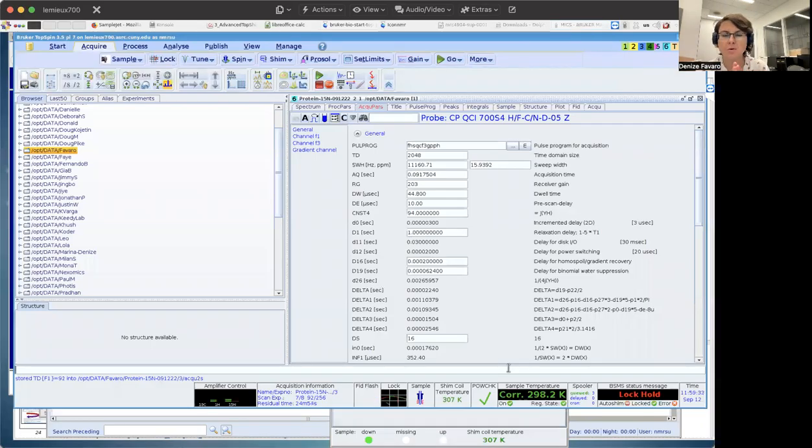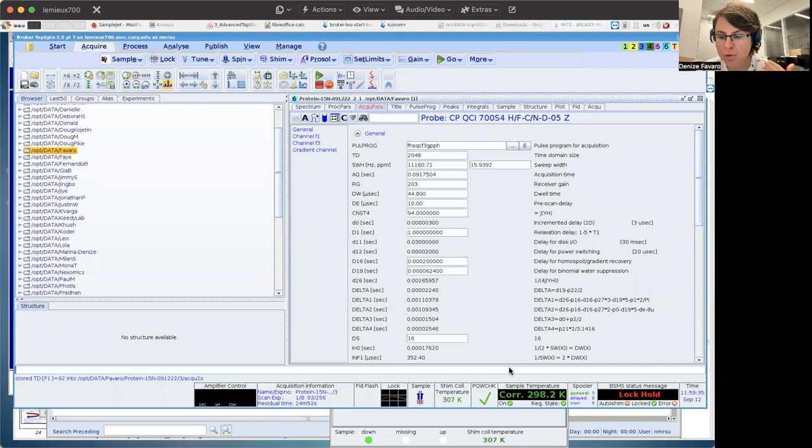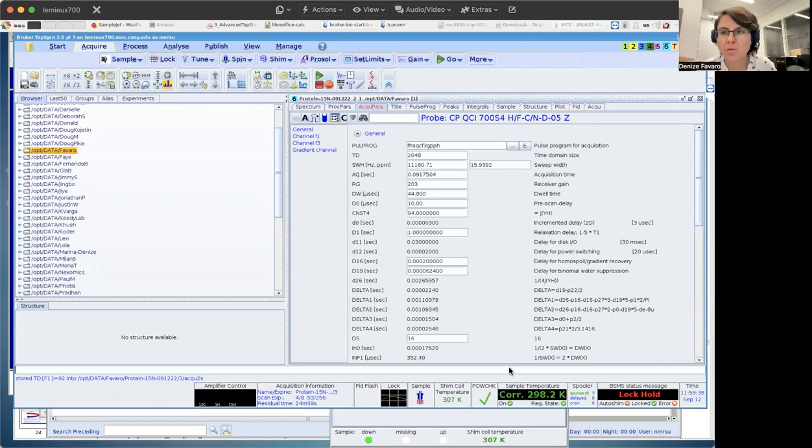Hello, everyone. On today's video, I'm going to show you how to run a nitrogen-15-HSQC.